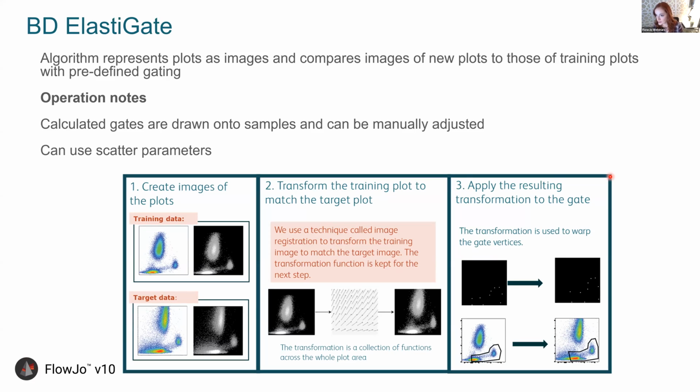Okay, there's a follow-up question here. Oh, so no spectral parameters, only unmixed stainings. Moritz, I think you can use spectral parameters. I would just make sure that they've been compensated, and I think maybe that's what you're getting at with the unmixed stainings. So I would probably use compensated parameters. It doesn't matter if they've come from a spectral instrument or a traditional instrument, if that is your question.